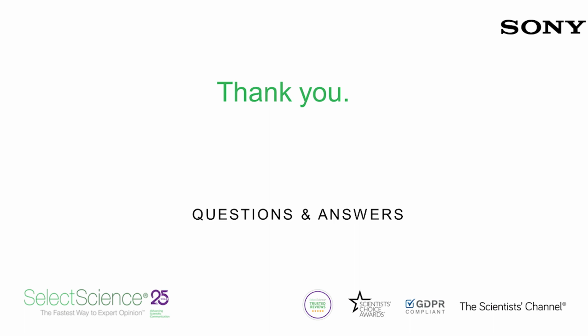Great, thank you. My next question here is, are there any best practices that your lab follows to get high yield of single sorted neurons for RNA-seq assays?